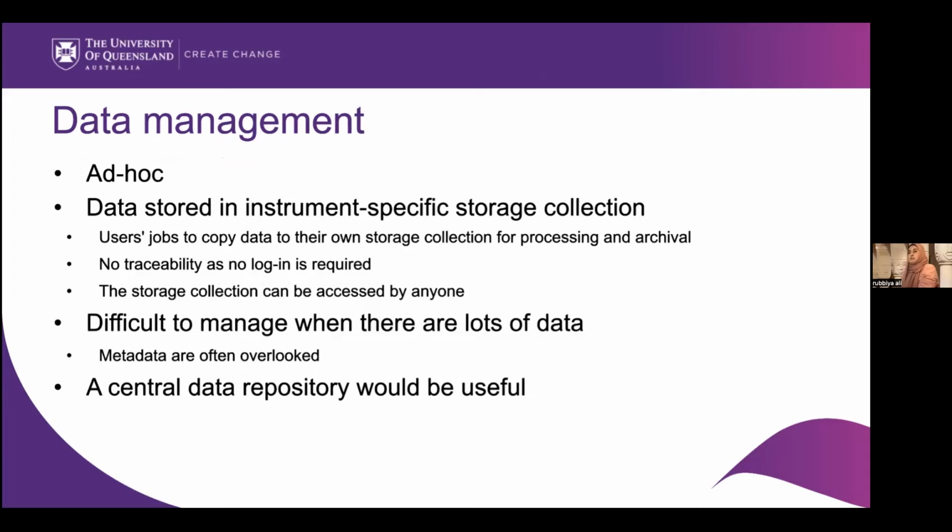The other thing was that there was no central workflow and no standard, and no specific naming conventions. For example, user A comes in and names his folder ABC, and another comes in with XYZ. After 20 days, they forget the names, and when they come back, they can't find their data. The data was stored on the instrument RDM collections, which means it was accessible by all users who had access to that instrument. It was one big folder, and we had a lack of data security at that level.